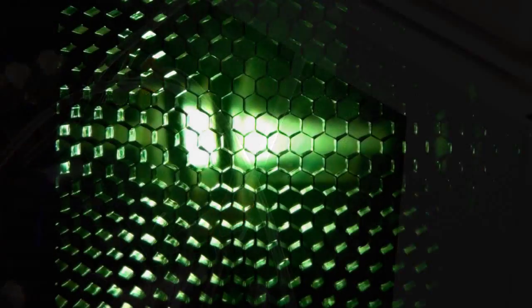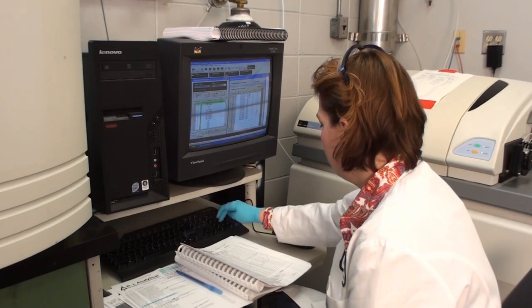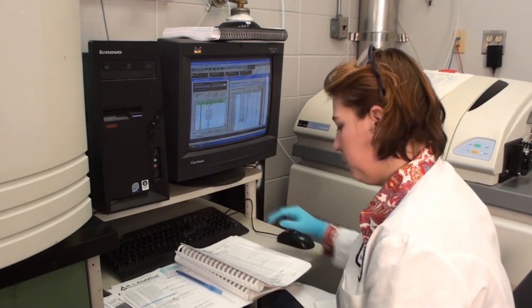After the ICP has completed its analysis, one of our technicians will quality control the data. Then it will be uploaded into our laboratory information management system.